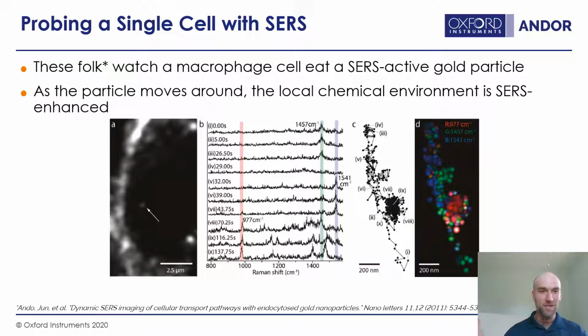The cell, of course, isn't a guy or an animal. It has vacuoles and stuff or whatever they are. But it brings the particle into its environment and traffics it through and interacts with it. As that nanoparticle bounces through the cell, it starts to light up with different spectra because it's showing you the chemical environment of the part that it's accessing.